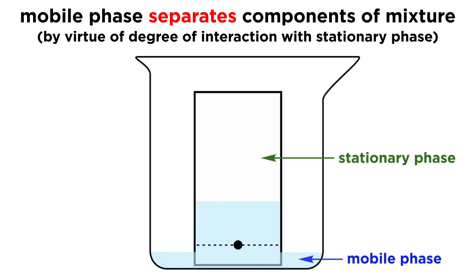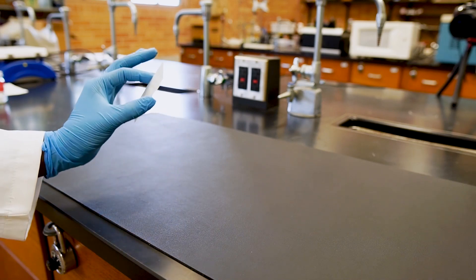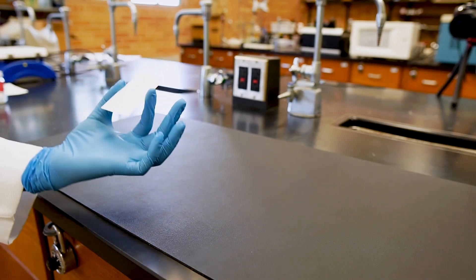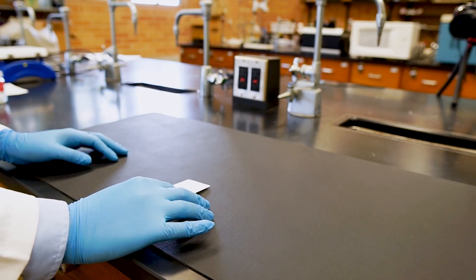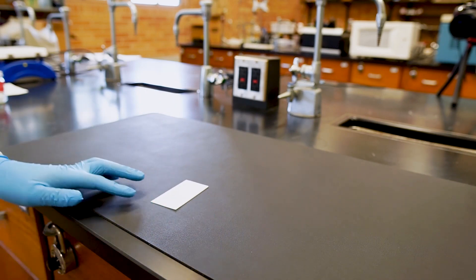In TLC, the mobile phase is the solvent, while the stationary phase is the thin adsorbent layer, also called the TLC plate. To perform thin layer chromatography, the main thing we need is the TLC plate. These can be different sizes depending on how many samples we're separating. Let's use this one today.